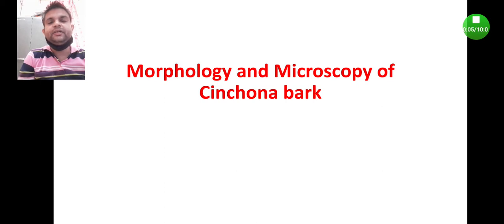In this experiment, we are going to discuss the morphology and microscopy of cinchona bark. Before starting that, let's understand the basic characteristic features of bark, what it is, and what its important morphological features are.